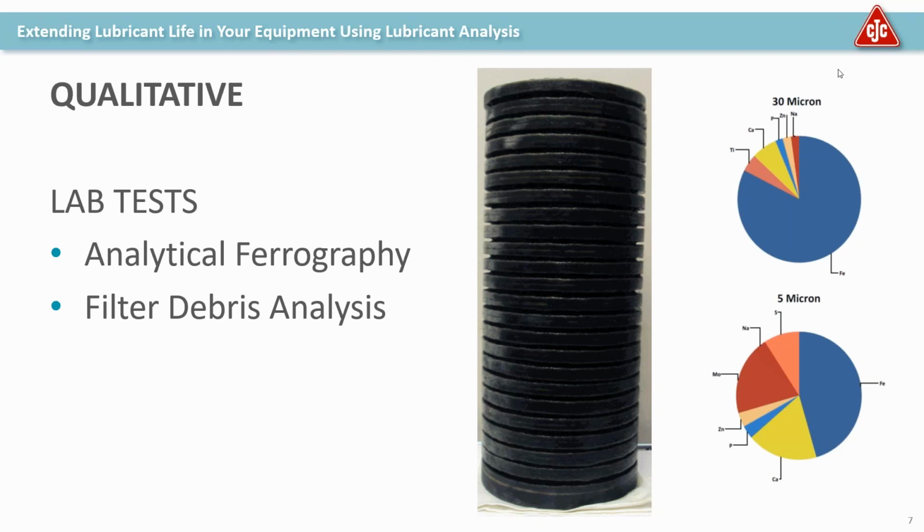So I know when we were talking about setting up this webinar initially, we were doing a lot of discussing about contamination, and I've had a lot of experience with reliability professionals and plants in various places that have just tested particle count, and that is it. That is the only thing they're using. And sometimes I worry that there's a little bit too much focus on ISO codes, and I think that's a little bit more of an older school thought. Obviously, it's very useful in filtered equipment, but sometimes I think we're trying to extrapolate too much information on the overall health of the system. And I know this is something that you have some thoughts on too, if you want to share those.